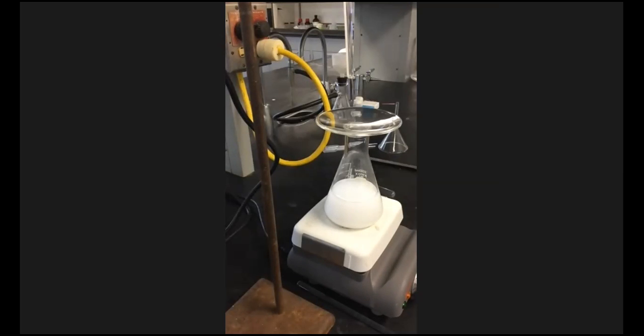Okay, I'm gonna check this temperature, and once I do that, I'm gonna go ahead and do step 3, which is I'm gonna weigh my filter paper because I want to know what my filter paper weighs, so that when I get the calcium oxalate on it after I filter it, I can know how much calcium oxalate I have by just subtracting the mass of the filter paper from the mass of that plus the salt. I'm gonna walk you through all those calculations too, because I have an Excel file set up for that. All right, so let me check the temperature real quick.